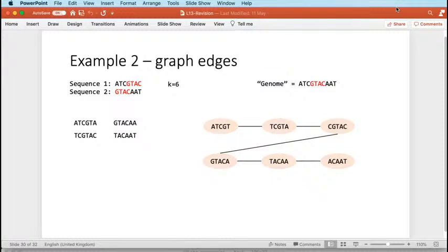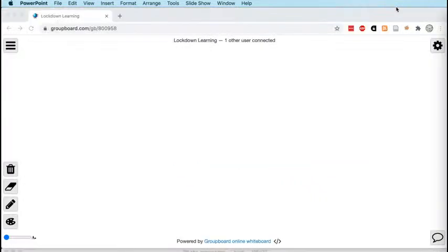So that's not necessarily the best, most elegant example, but it works to show how the choice of k is the essential parameter optimization for assembling a reference genome, for assembling a genome in a de novo way. Obviously, in a real experiment, the value of k is not quite so simply defined.